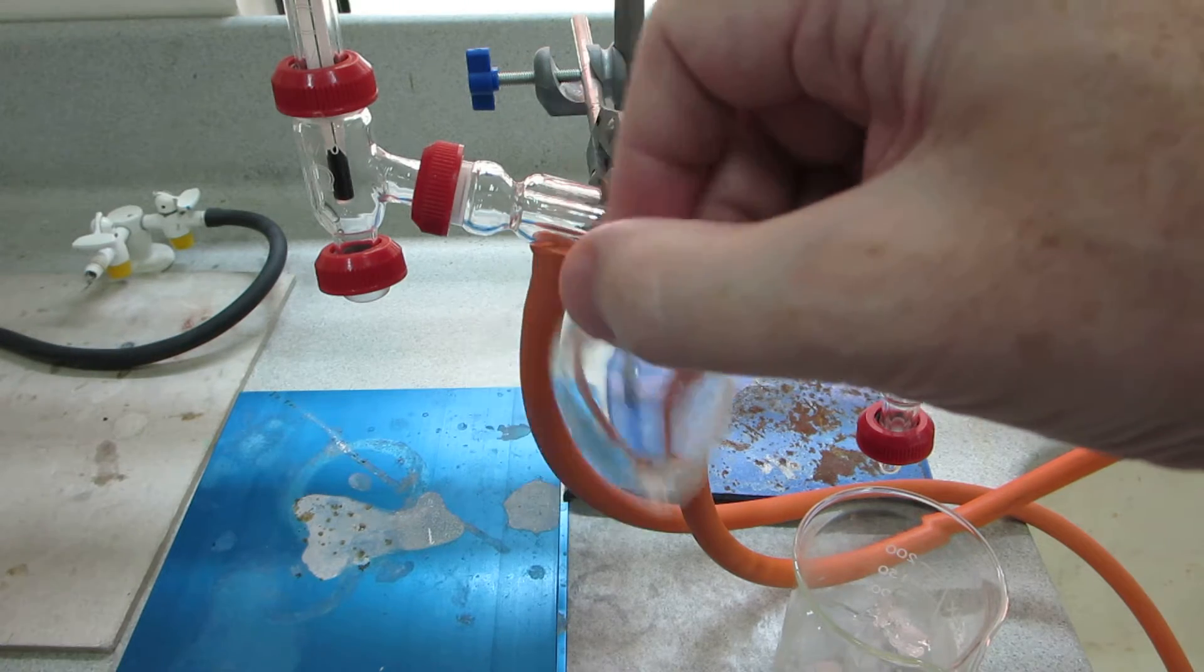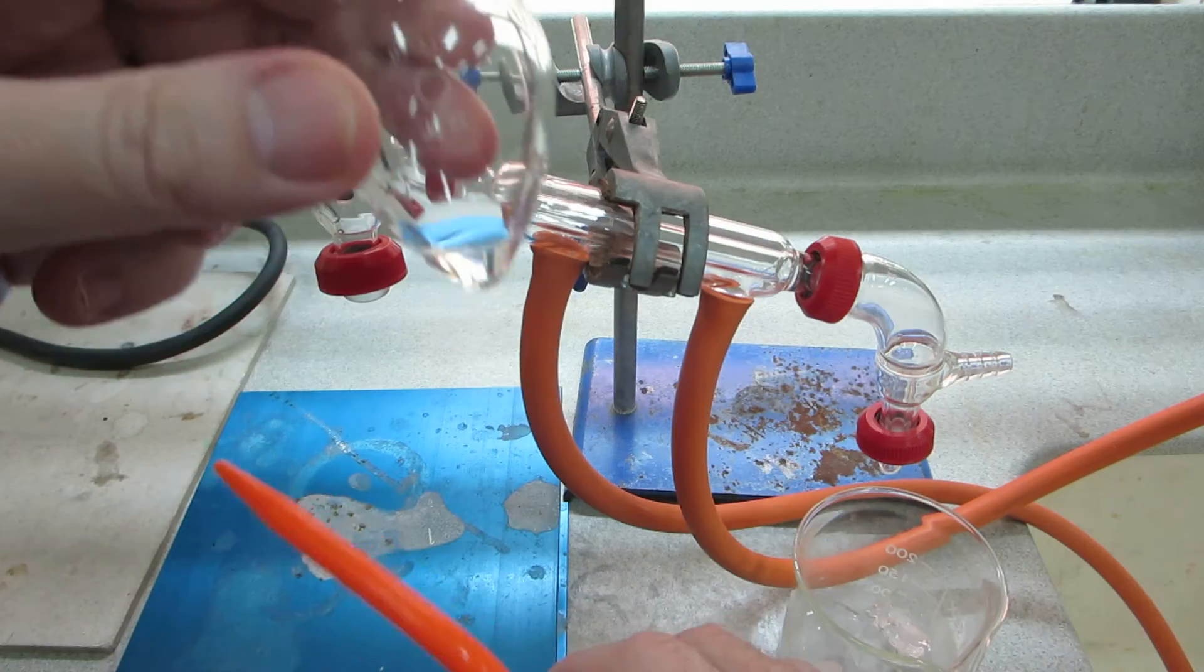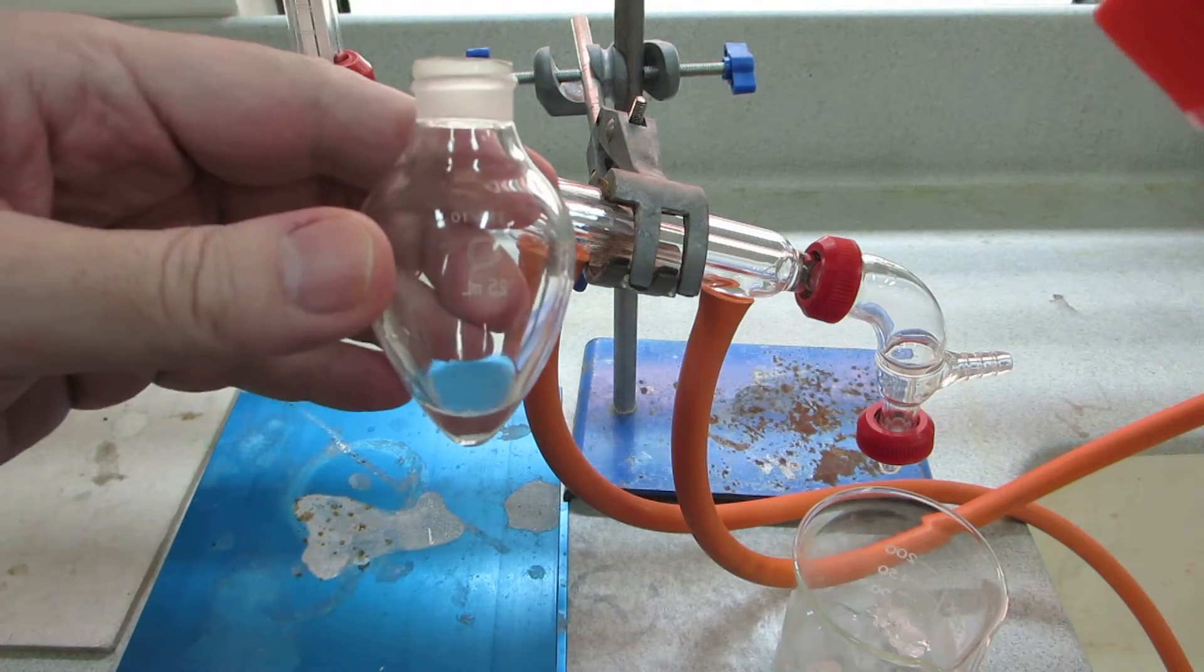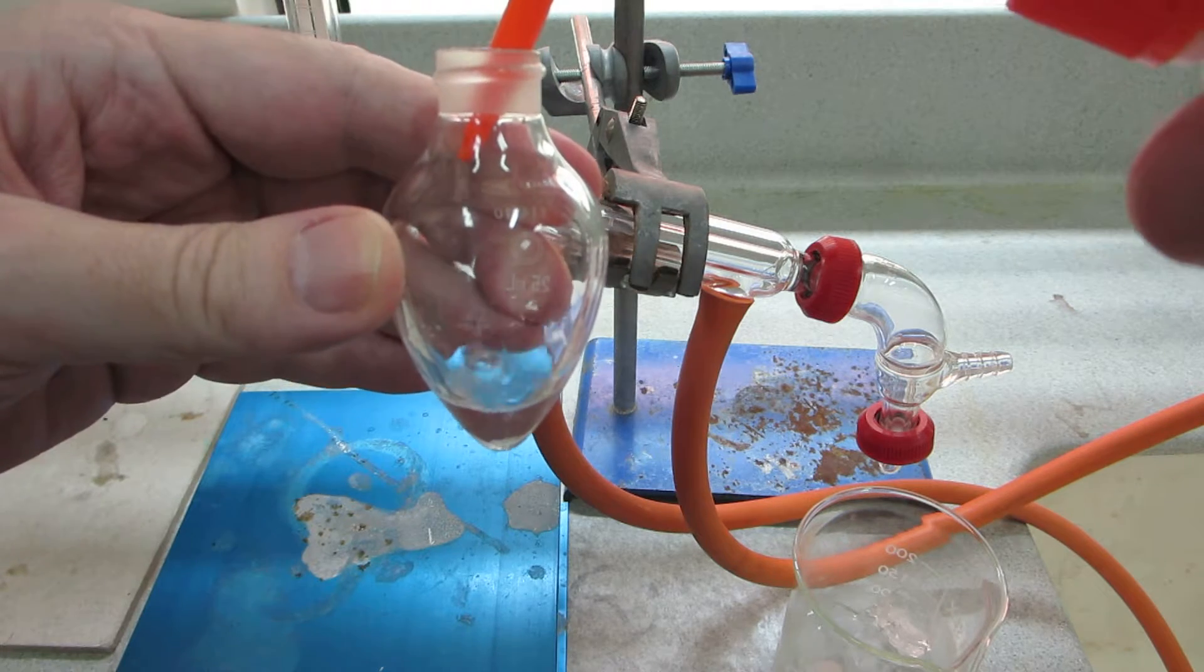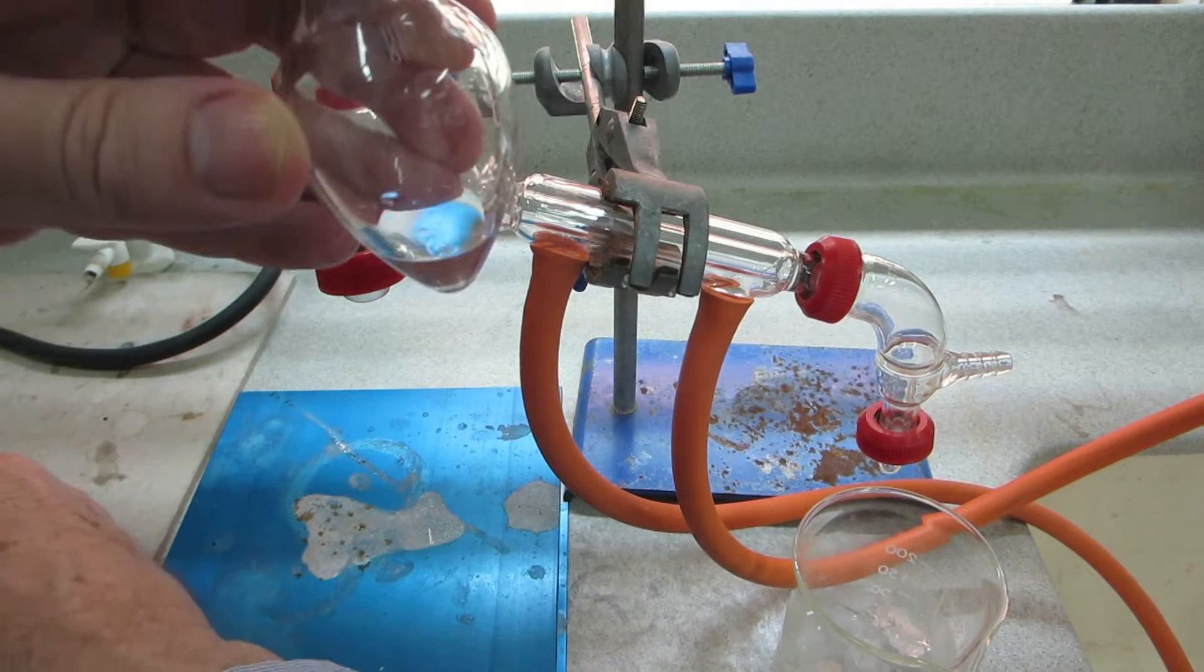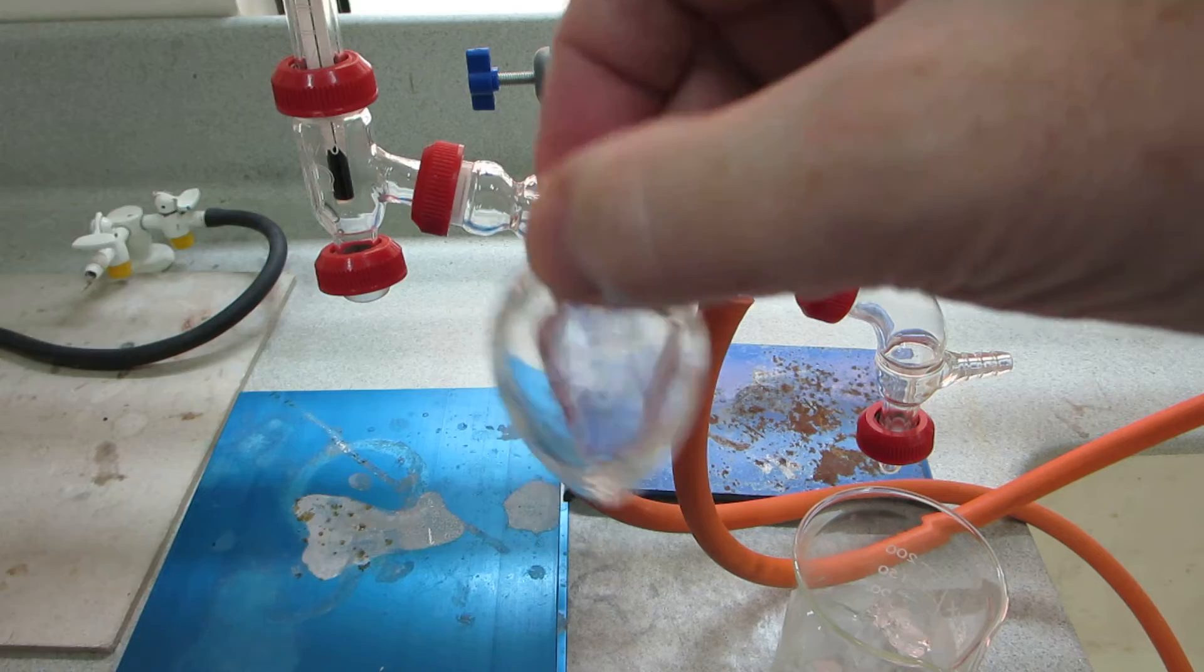Once we've dissolved the iron(II) sulfate we can add the ethanol and we need to add about one to two ml of ethanol. Estimate that and now we're ready to add the hydrogen peroxide.